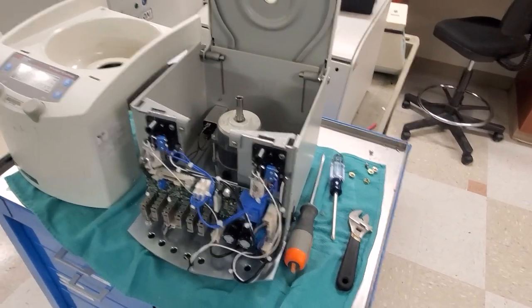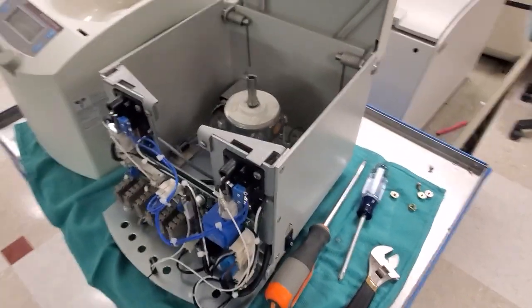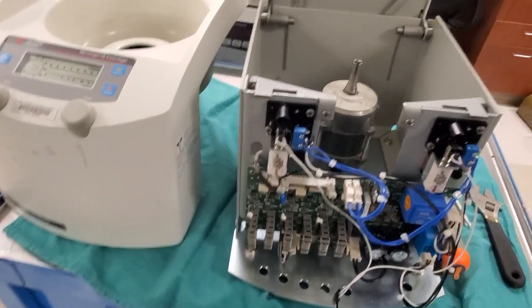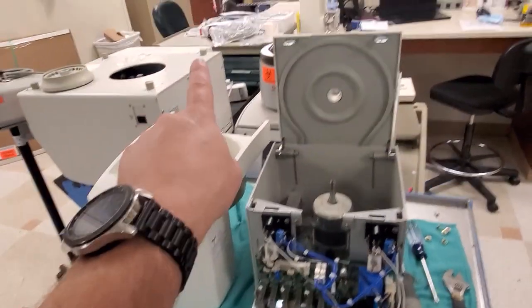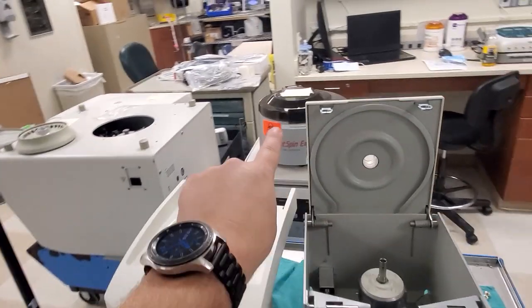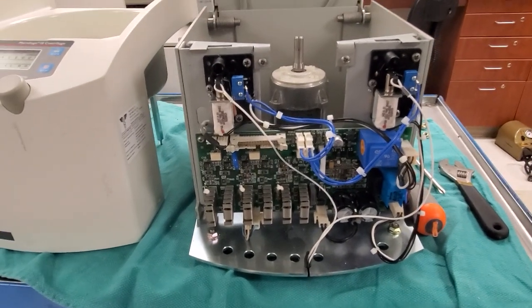Here you can see I got one broke open. Look at this — motor mounts are completely gone. But this is an excellent example of the centrifuge. This is a high-speed centrifuge; I think this one goes up to 14,000 RPMs. Normally they go up to about 3,000 to 4,000 RPMs. The smaller ones generally go faster. But this is a pretty good breakdown of what we're going to look for.